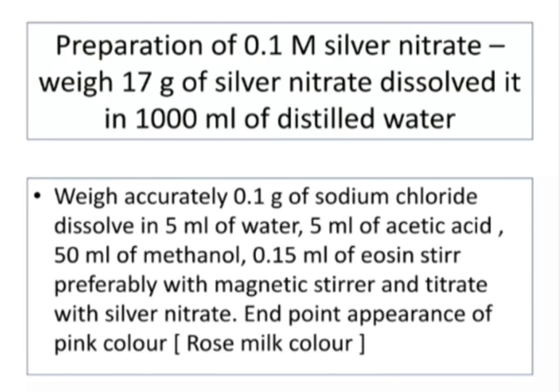The adsorption indicator eosin is the most suitable one, which can be used in dilute solutions and also in the presence of 0.1 M nitric acid, but ethanoic acid solutions are preferred. Fluorescein can be used, but faces the same limitations as with chlorides. When eosin indicator is used, silver bromide flocculates 1% before the end point and a red color develops, which is more distinctive, and on addition of silver nitrate solution at the end point the precipitate turns a magenta color.